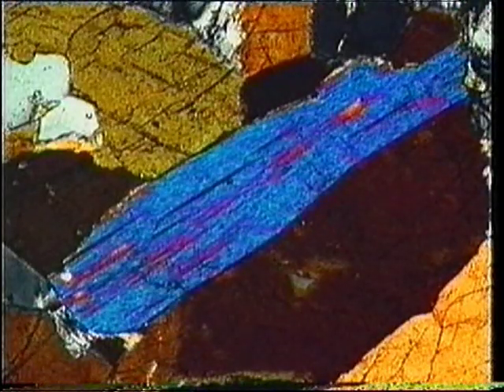Rotate 90 degrees to check. There's a fall to black. So there's a rise in the first position. Therefore, Z is northeast-southwest.